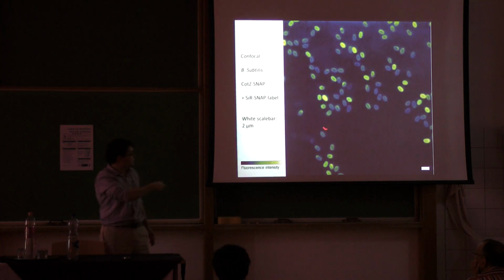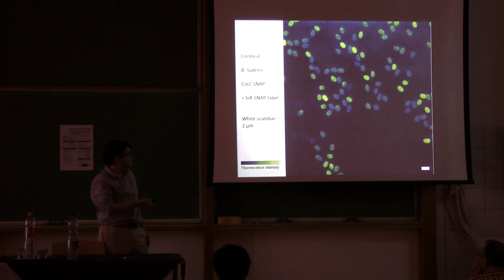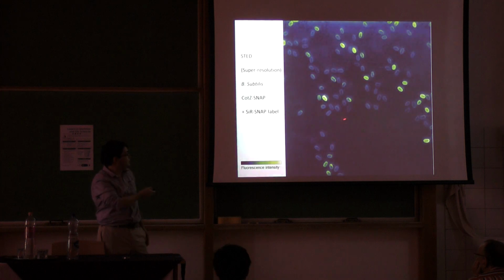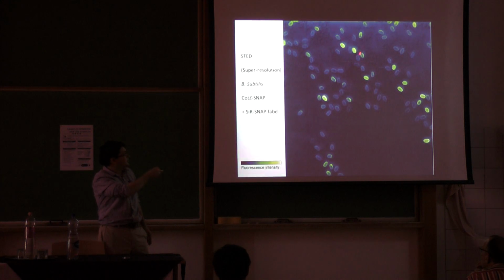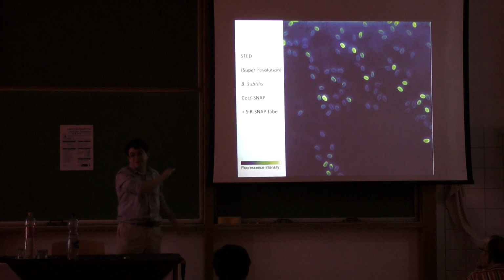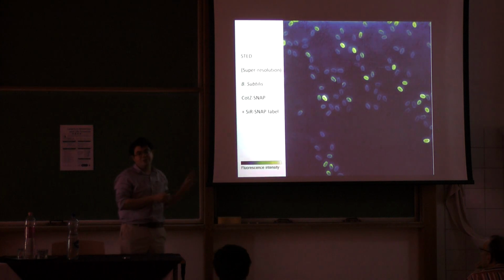We take a conventional confocal image of the spores, and they look like this. And I've just color mapped fluorescence intensity onto that instead of black and white because it's more interesting. So that's conventional confocal, and we get a much better quality image by using STED to look at this coat. So we see much more clearly that just the outside of the spore is fluorescent. That's where the outer crust is. And this is very good. It means that no matter what the sample is, we can take a high resolution picture of it.